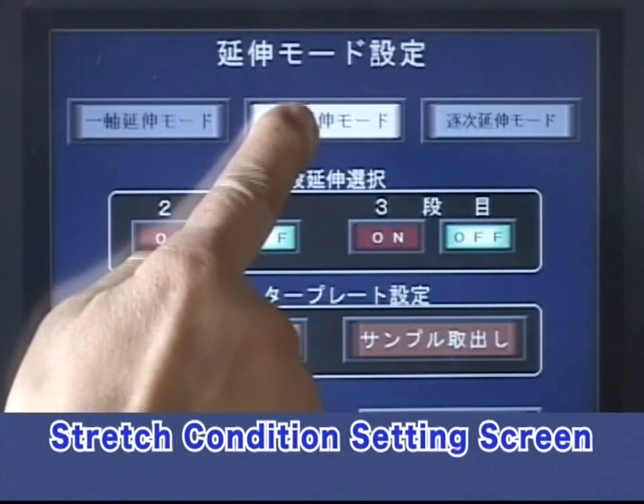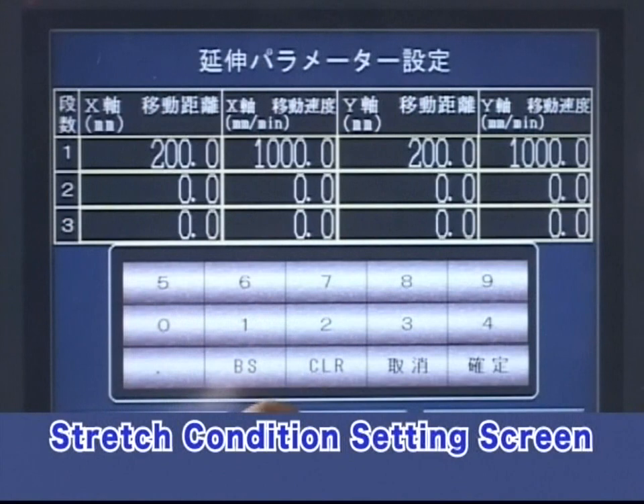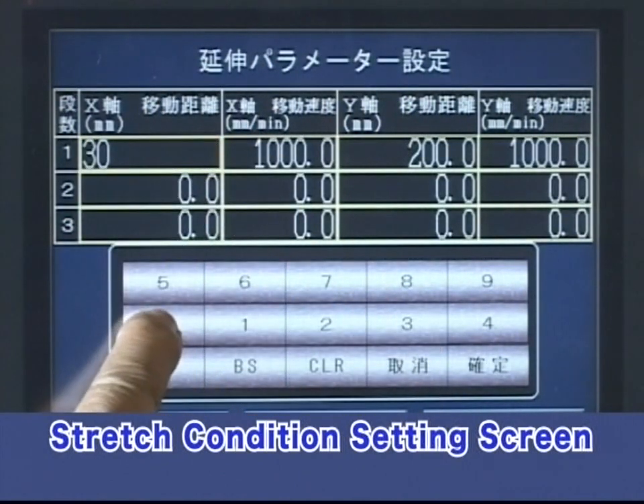See the operation panel. Setting stretching conditions — including stretching ratio, speed, and temperature — is simple on the easy-to-use touch panel.